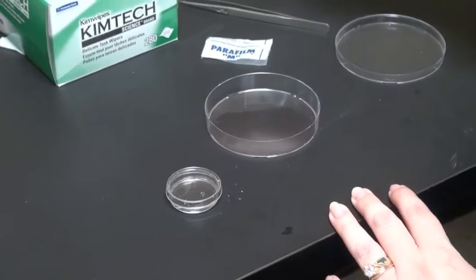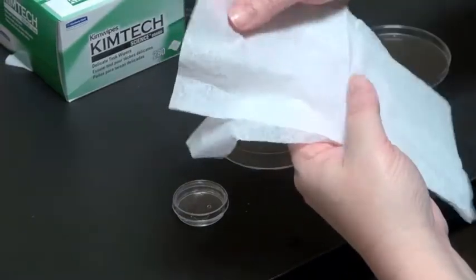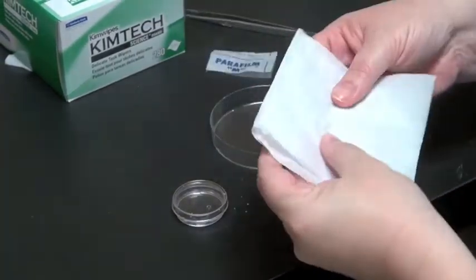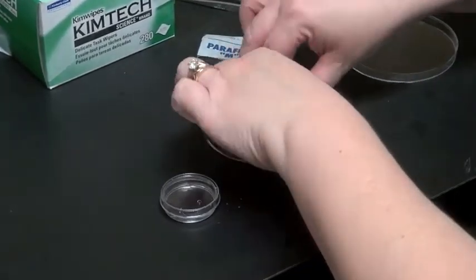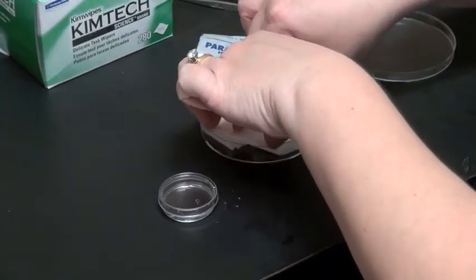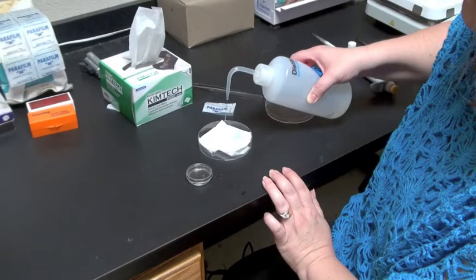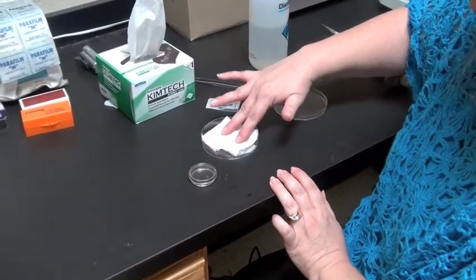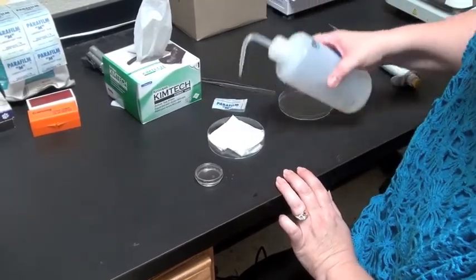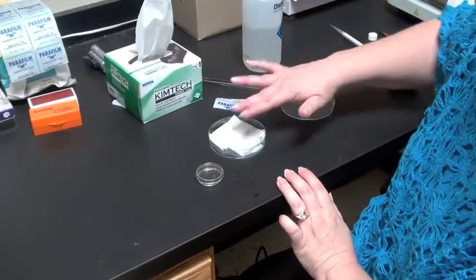The first thing you want to do is use Kim wipes or paper towels — some type of paper product that you can fold and place into the bottom of your chamber. Then you're going to use some distilled water and wet your paper. It needs to be wet to the touch but not leaving a lot of standing water in the bottom.